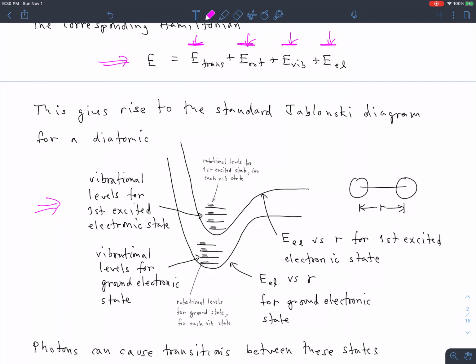First of all, these curves here represent the potential energy of the atoms as they're stretched to the breaking point when you're out here. So this is R along this direction. As we're moving in this direction, we're stretching the I2 molecule. And when you're way out here at very large R, you've broken the bond, right?